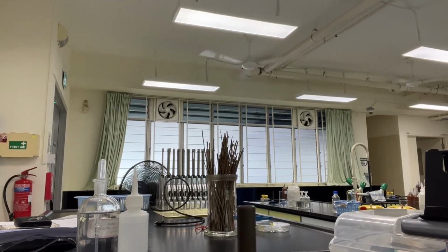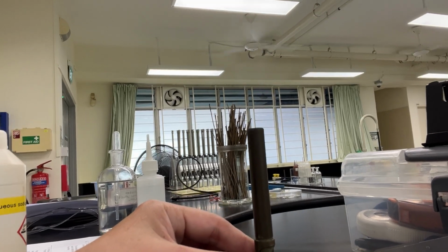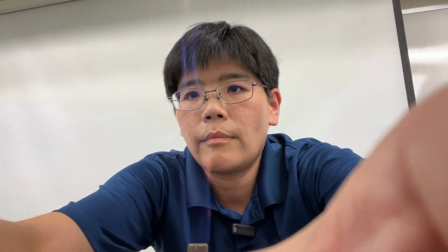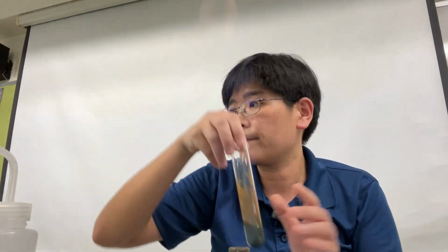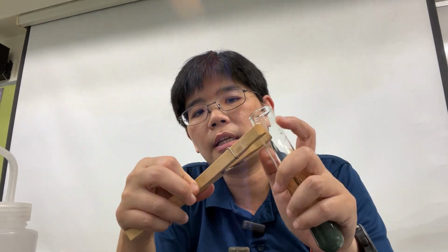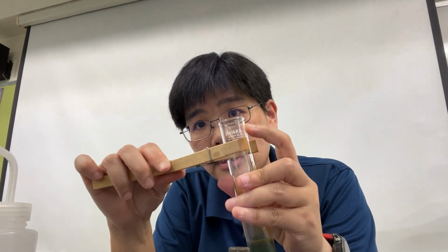Because we are going to heat the solution, I would close the air hole a little bit to get a weak orange flame, which is a safety flame, suitable for heating solutions like what we are doing today. We hold the boiling tube using the test tube holder, which we put at the neck of the test tube, where the words are.